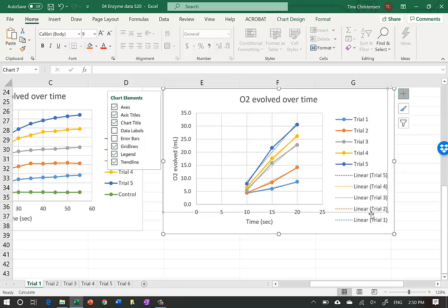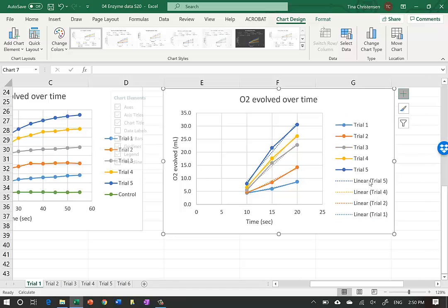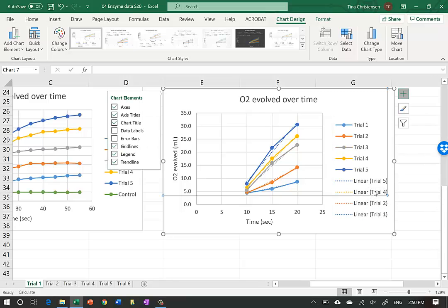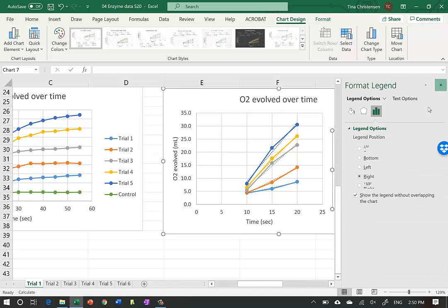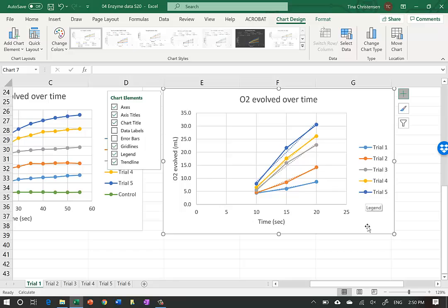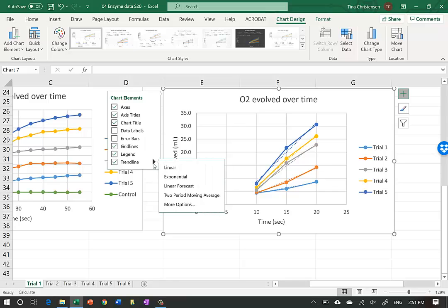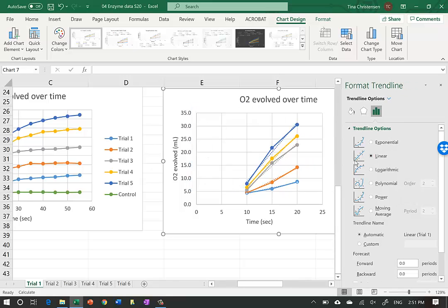I remove the extra formatting clutter and clean up the display. Now I'll tell Excel to add an equation to each trend line. I go to the plus sign, select Trend Line, click the arrow for More Options. I make sure it's set to Linear trend line, then scroll down to the very bottom and check 'Display Equation on Chart.'